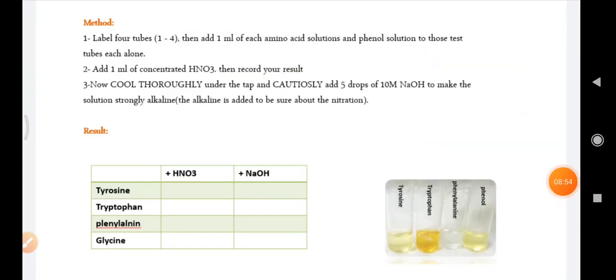So, what will be the procedure? We should take 4 test tubes and label 4 test tubes for tyrosine, tryptophan, phenylalanine and phenol. And add 1 ml of each amino acid solutions or protein solutions and phenol solution to those test tubes each. Then, add 1 ml of concentrated HNO3 and then record your result.